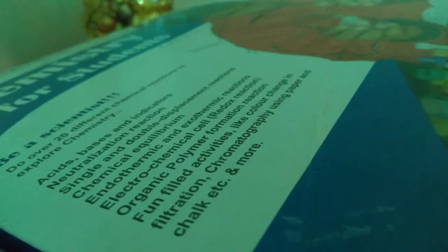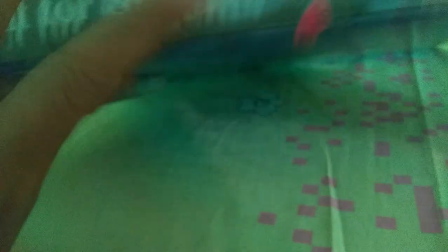So this is the chemistry set inside. It's first to gain. Nothing more inside. So this is the set.